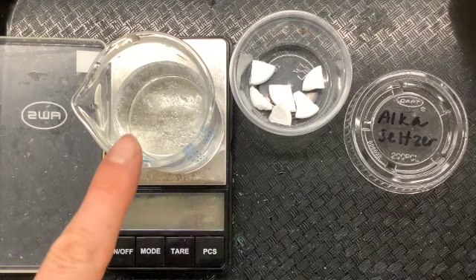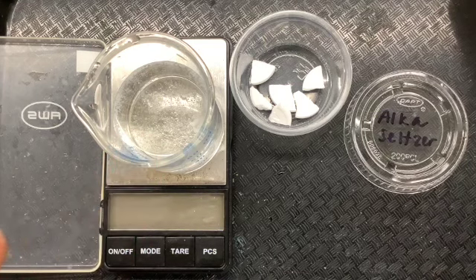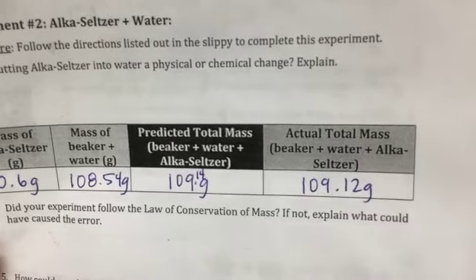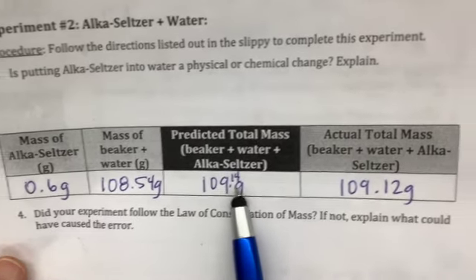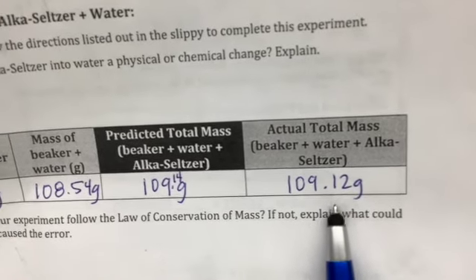So we saw gas bubbles coming out of here, right? Gas, when it escapes, goes into the air all around us. And so it's really hard to weigh that air once it's been released from our solution. So it would kind of make sense that our numbers decreased a little bit. So if I added just 108.54 plus 0.6 together, I would get 109.14. But the actual total mass was 109.12, or 109.11 even.